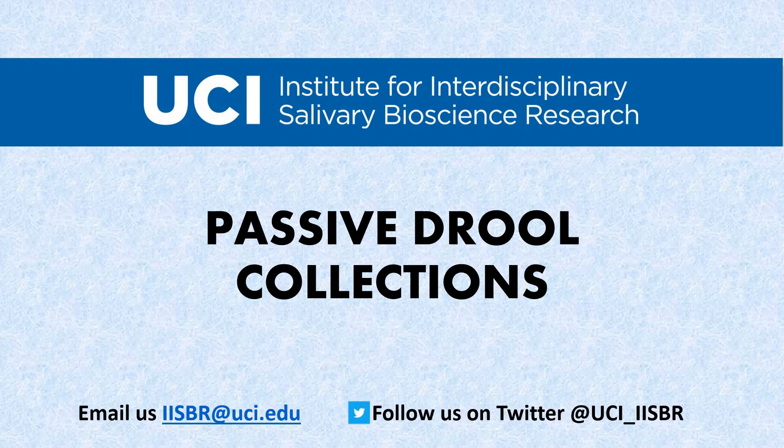In this video, we will be going over how to collect saliva samples using the passive drool method.